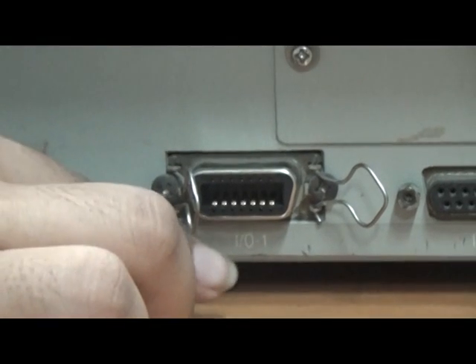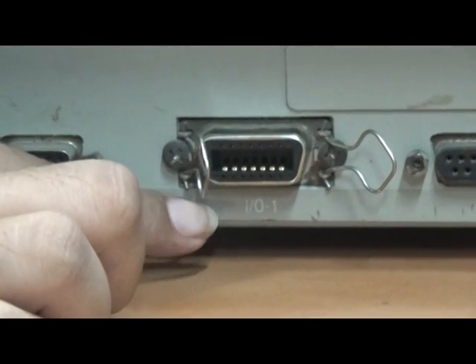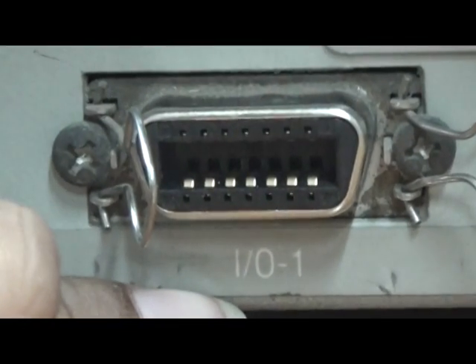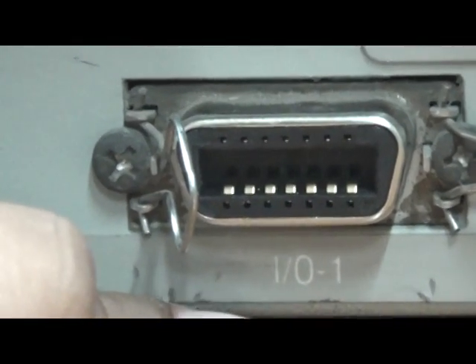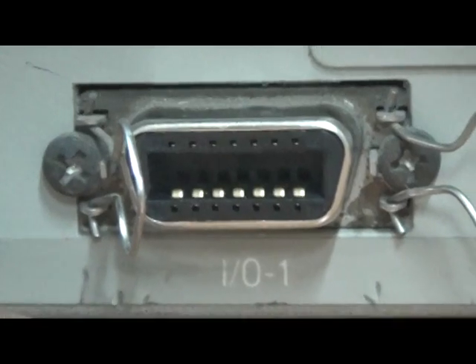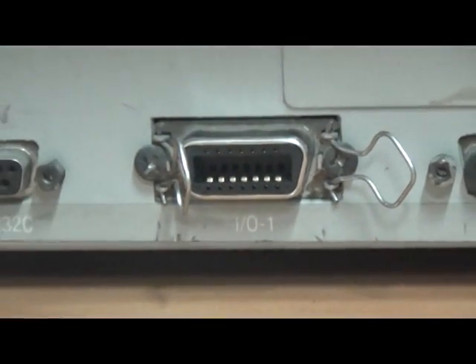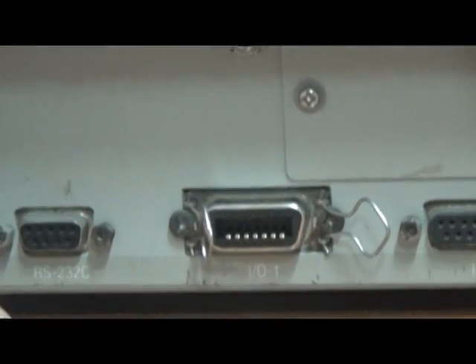Second is the attachment connector, that is IO1, input output first. This is the interface for connecting the optional auto sample changer or cell positioner accessories.